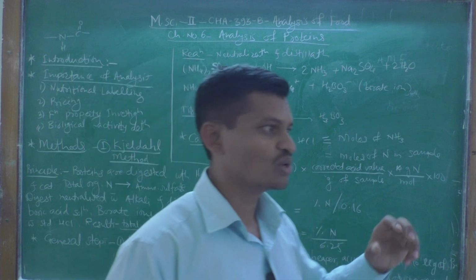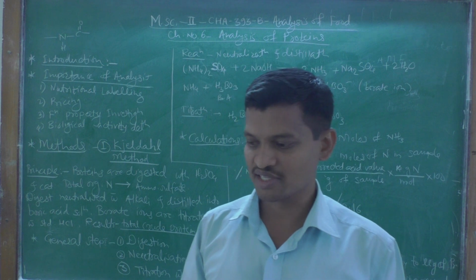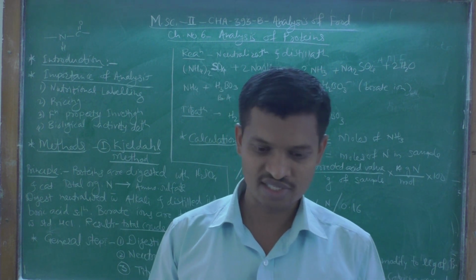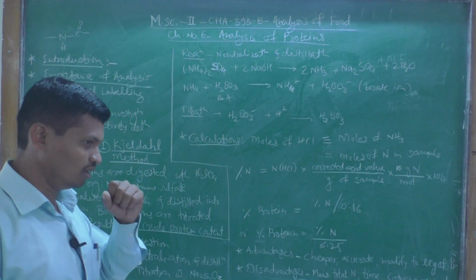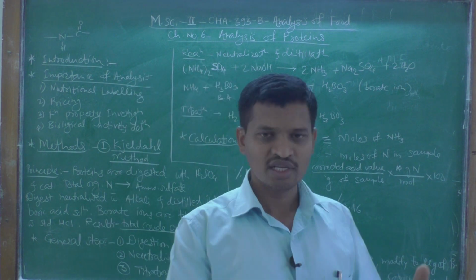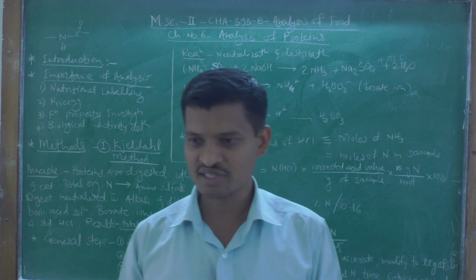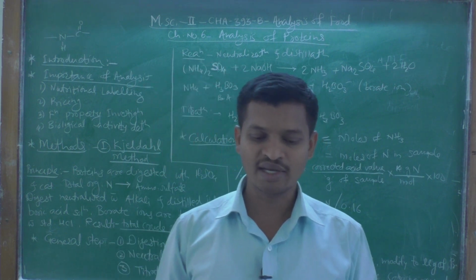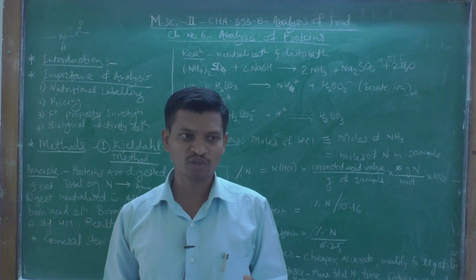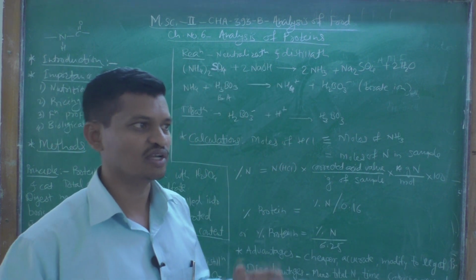As we are studying food analysis, protein analysis is one of the essential parts of it, and that's why several methods have been developed during the last 100 or 200 years for food analysis. Due to these, recent advancements have been put forth by different groups of scientists in different countries for the analysis of proteins in foods.